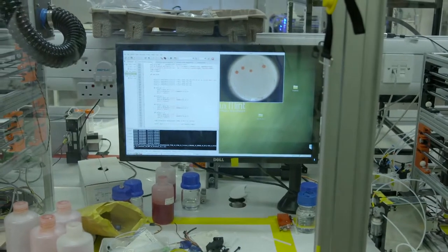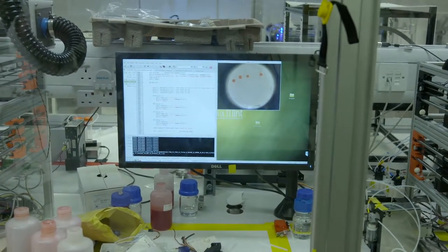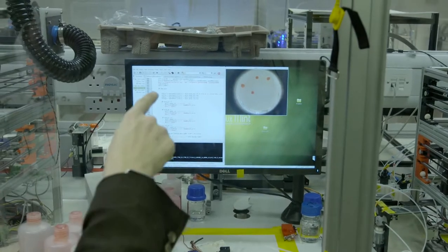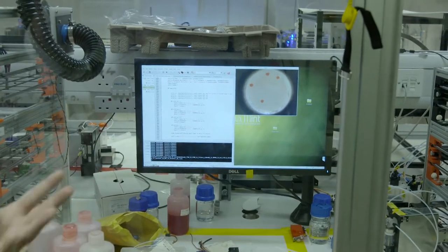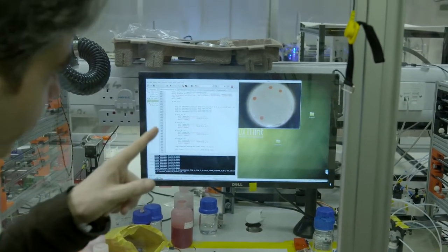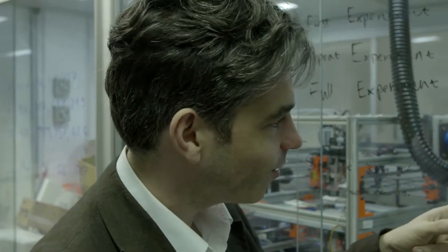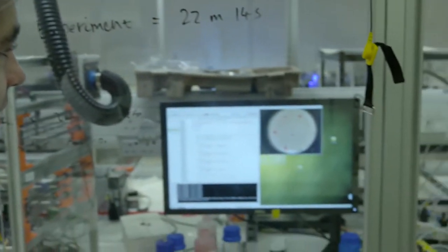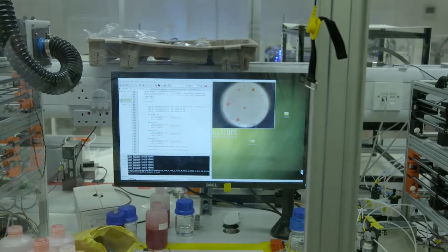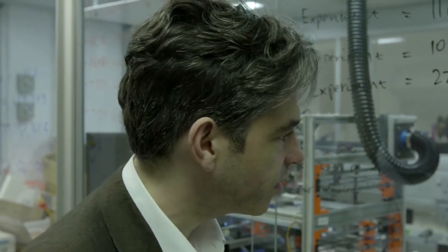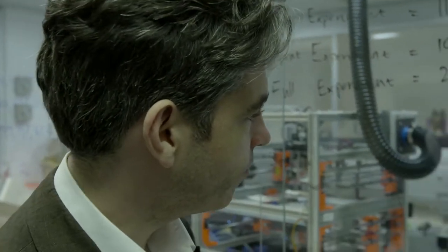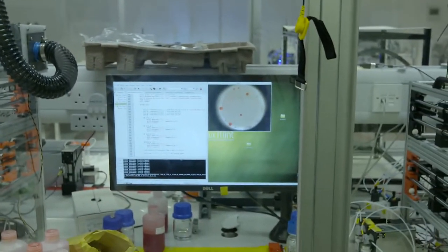Look at this one moving around over here — that one is almost decomposing, almost falling apart, but they're wobbling. Can you see? There's no life in them but they are wobbling around, getting excited, searching, vibrating. Oh — that one just split into two, into three! And these are really simple mixtures, no complexity at all, yet the droplets look like they are intelligent. This one at the bottom here keeps coming backwards and forwards, touching the side — they are very jumpy.